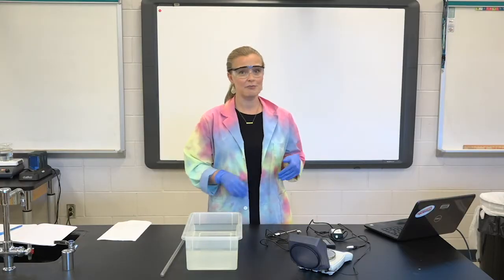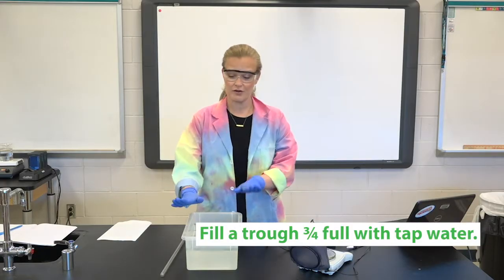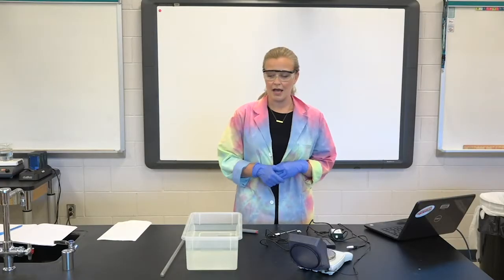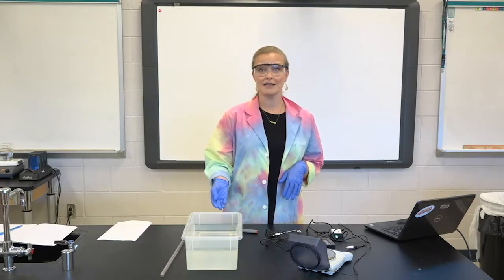There are a few things you need to do to set up before we get started. The first thing you're going to need is a trough of water, or just a big bucket of water, about two-thirds full. It can be tap water, it doesn't really matter. We're just going to use that to submerge and do a few things — it's not actually for reacting in the experiment.